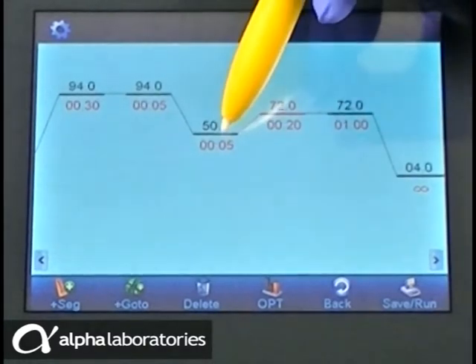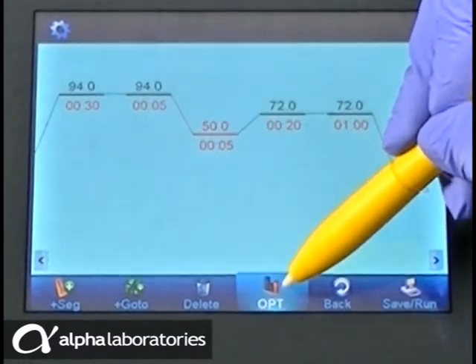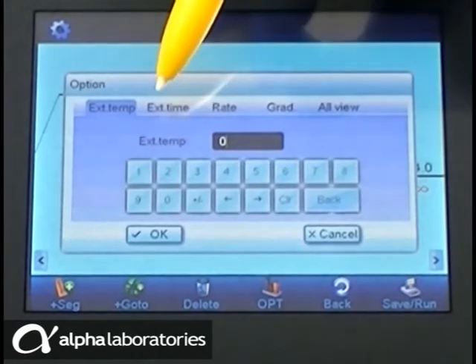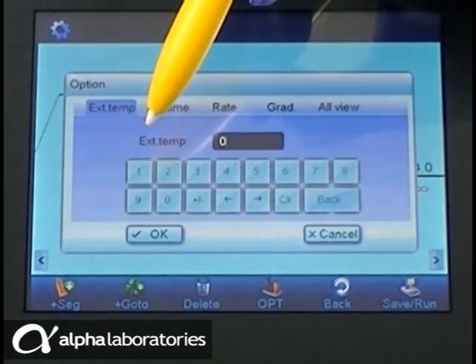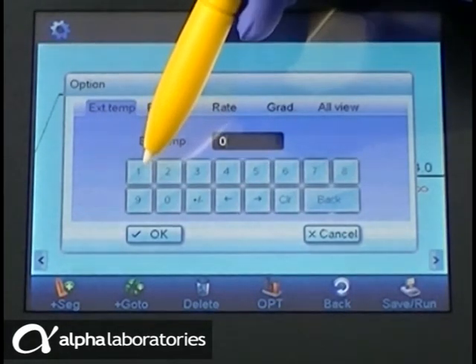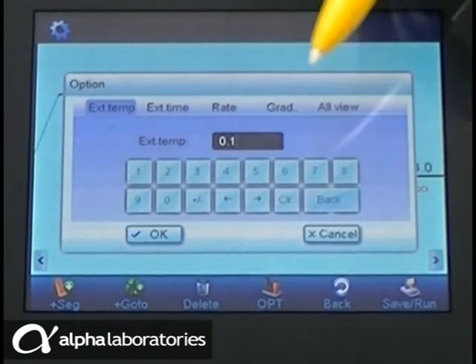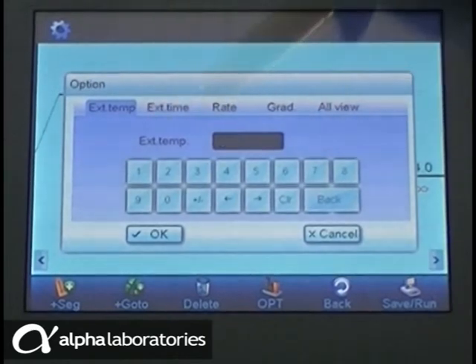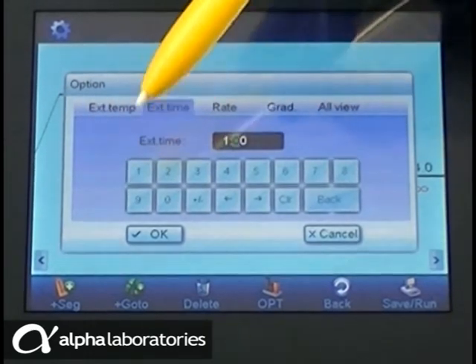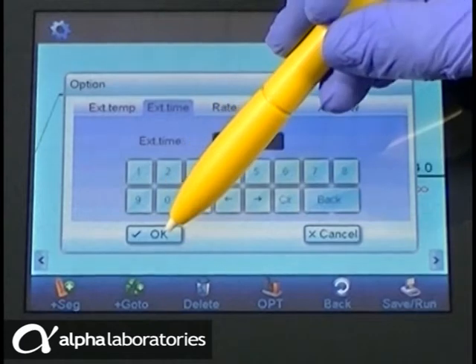For any step, there are additional options available within the OPT menu for simple setup of complex protocols. For touchdown PCR, the extended temperature function easily controls increased or decreased temperature at each cycle. Similarly, the extended time function lets you vary the time at each cycle, making it suitable for long PCR.